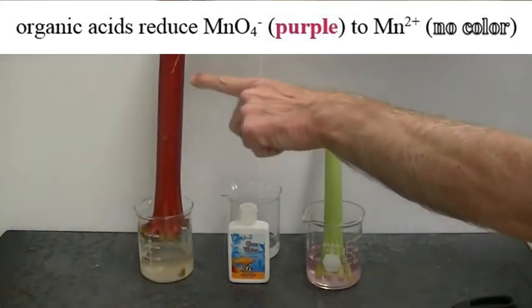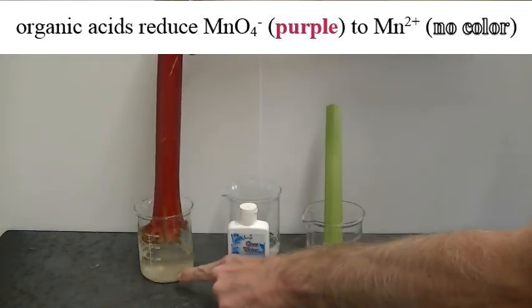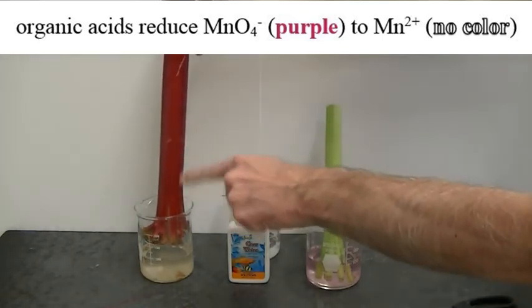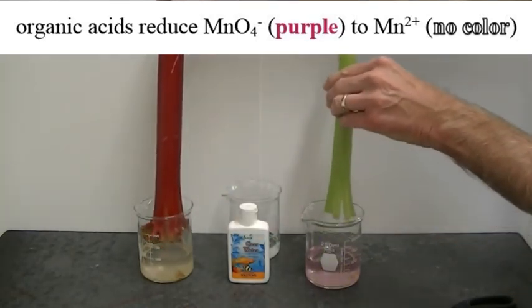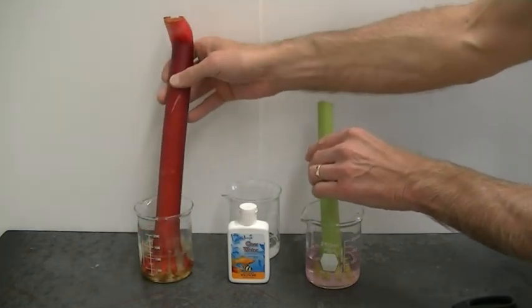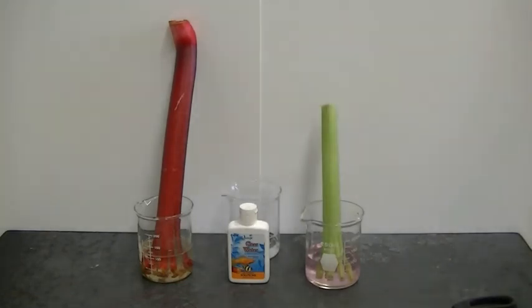So if you guessed that the rhubarb has more organic acids in it, well, it looks like you'd be right. The potassium permanganate has been reduced. We no longer see the purple color indicating that there are plenty of organic acids present in the rhubarb while there is comparatively very little in the celery stalk. So remember that the next time you eat a little bit of rhubarb pie, that tart, sour flavor that you taste in rhubarb pie is due to the presence of organic acids in your stalk of rhubarb.